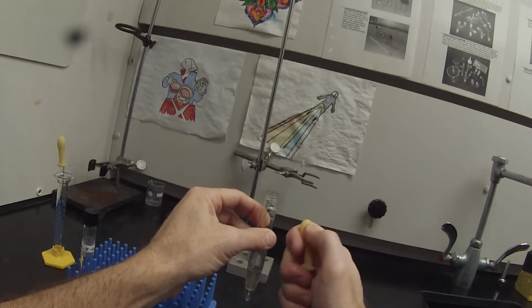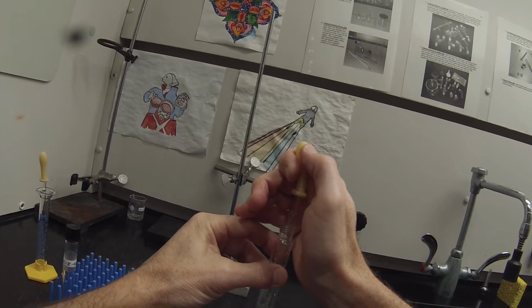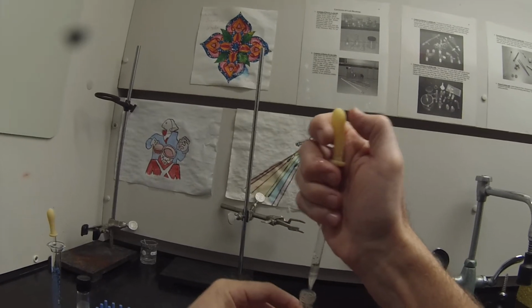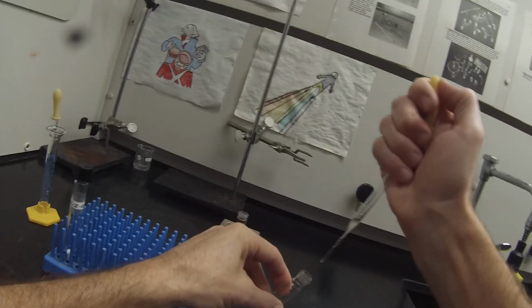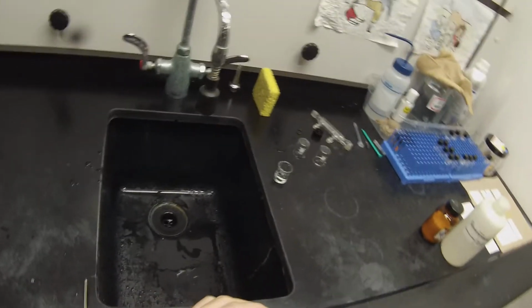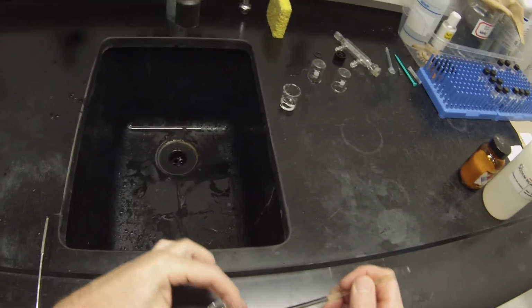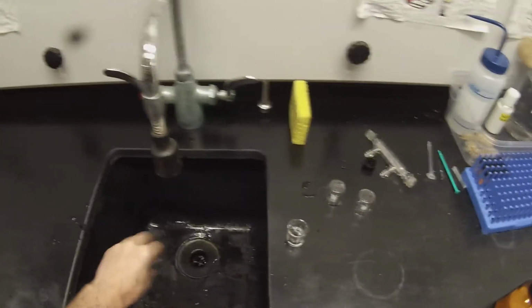Get bottom layer out. Drip the bottom layer out, and then we'll return the little bit of top layer that's in the pipette. And let's verify that that's not acidic. Okay, so now you can see that it's clearly not red anymore. That's a good sign. So 4 1 milliliter washes got the job done.